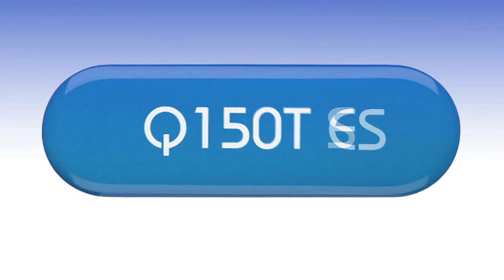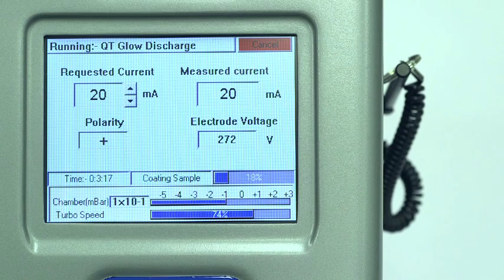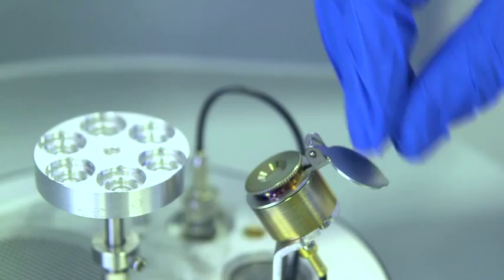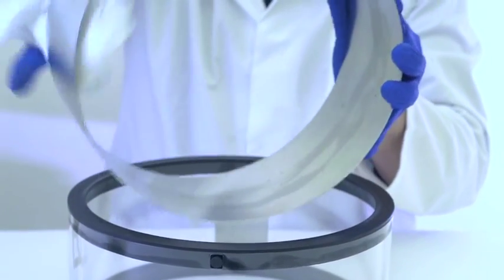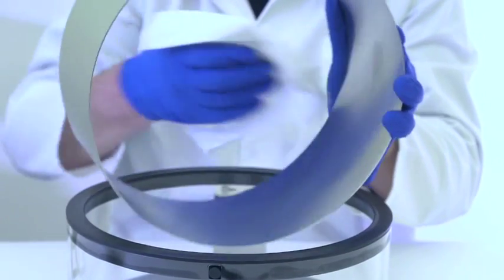The Q150TS and TES can both be fitted with an optional glow discharge insert. A range of options are available including a film thickness monitor for recording the level of deposition, internal chamber shielding for ease of cleaning and a range of 12 different stage options.